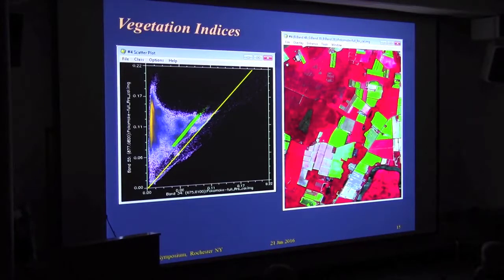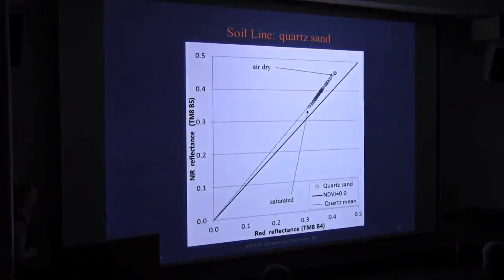Okay. If that hypothesis is true, then if I took the principal components analysis of those spectra of the soils from wet to dry, the first principal component should have 99% of the variance. And most of the variance that's left over, explained by the remaining principal components, should be pretty much random. Well, this is using Chow's data for the quartz sand. It's pretty linear, as predicted. It falls along the radial line to the 0-0 point, so there's no color change, at least in these two bands. So far, so good.